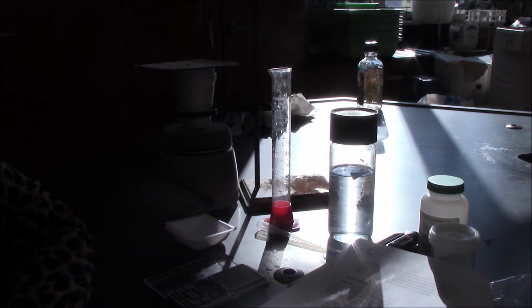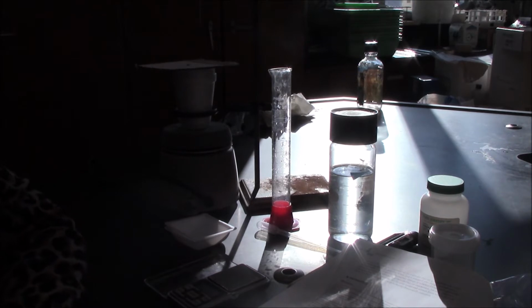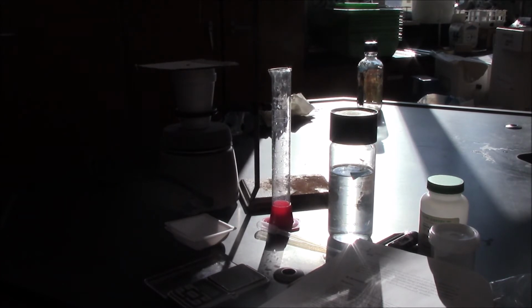The other part of the beginning of this lab is to calibrate our calorimeter. When we calibrate our calorimeter, what we're going to be doing is mixing equal volumes of water at different temperatures.